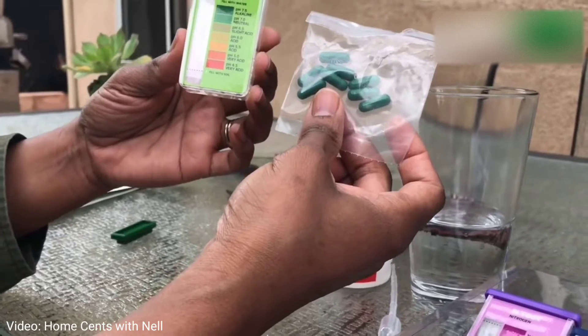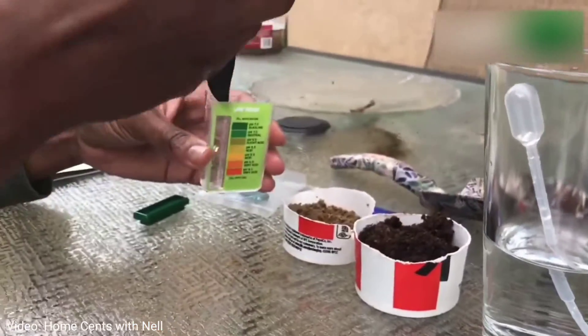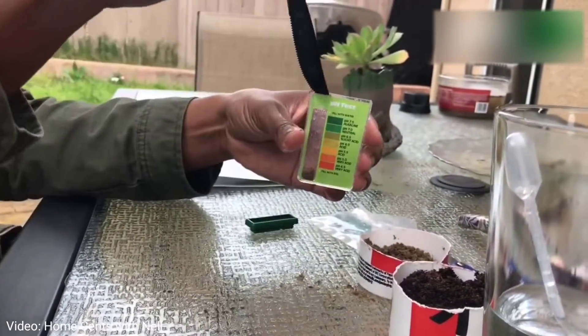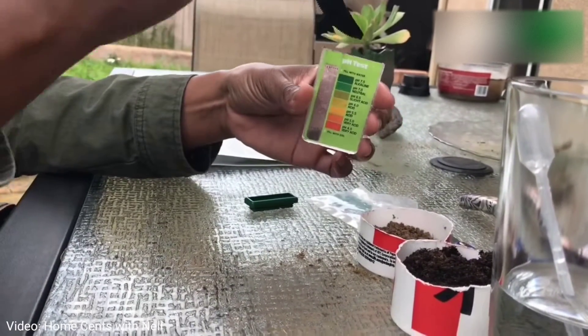Excuse my little dog in the background. The first step is to go ahead and put some soil into your comparator case on the left side, up to the fill line — it's going to be less than a teaspoon.